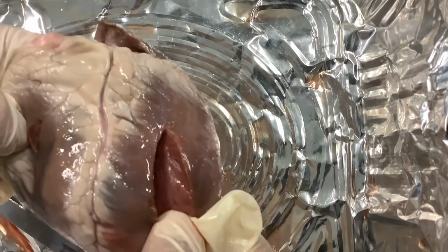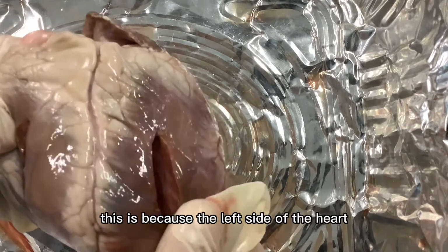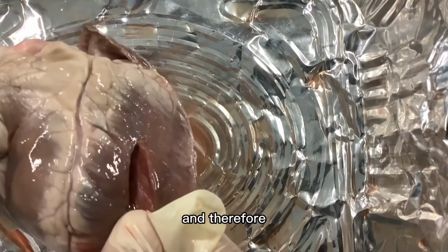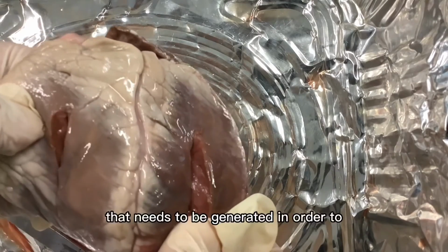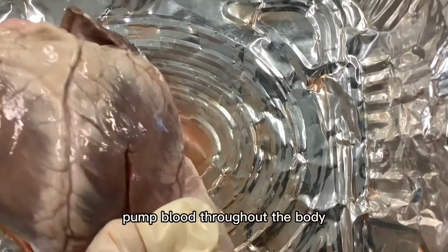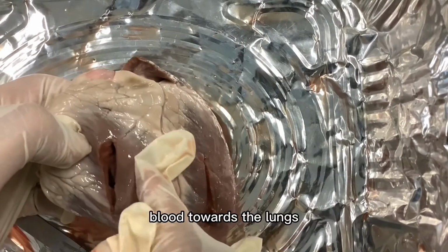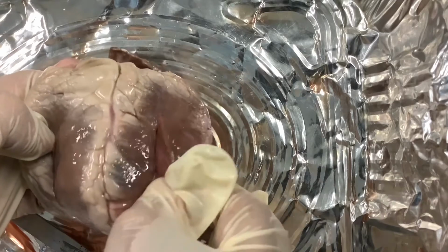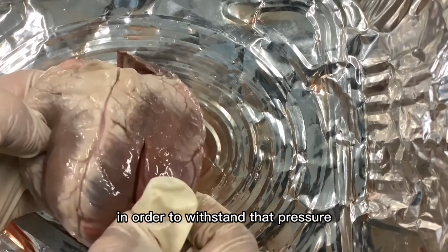And you would know that this is because the left side of the heart needs to pump blood all around the body, and therefore it requires a much higher pressure to be generated in order to pump blood throughout the body, whereas the right side of the heart only pumps blood towards the lungs. And because of the higher pressure that is required, you need more muscular walls in order to withstand that pressure.